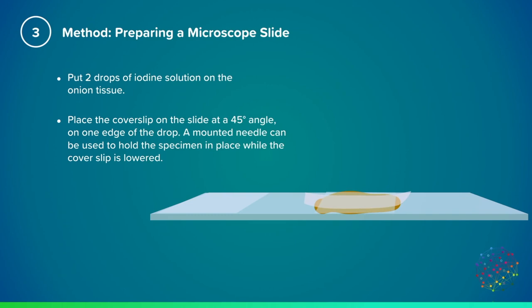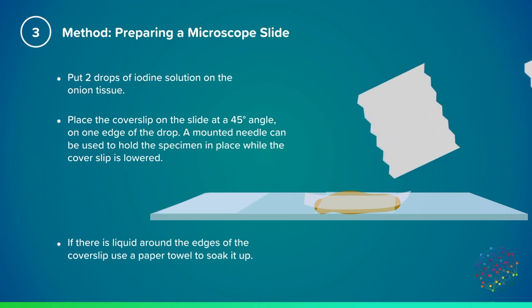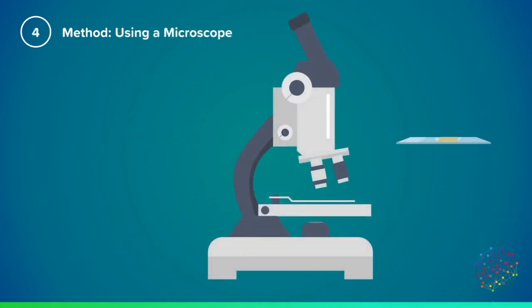And now, if you have any air bubbles or excess liquid around the microscope slide, you can then use a paper towel on the edges of the cover slip to soak up this excess liquid. So you've now prepared your microscope slide and it's ready for viewing.